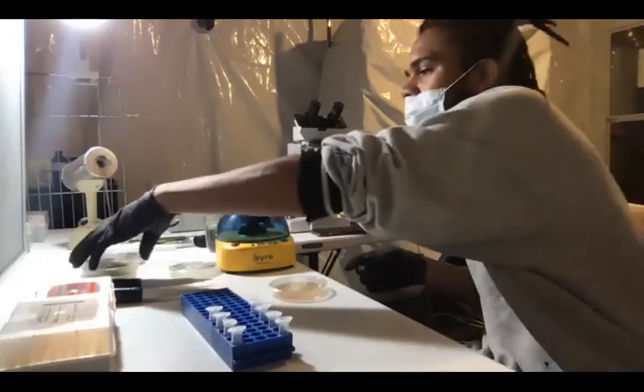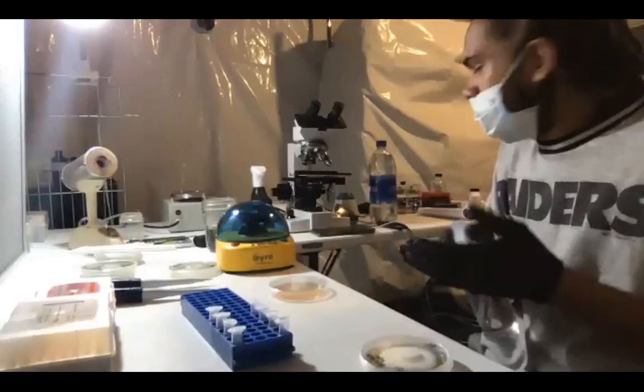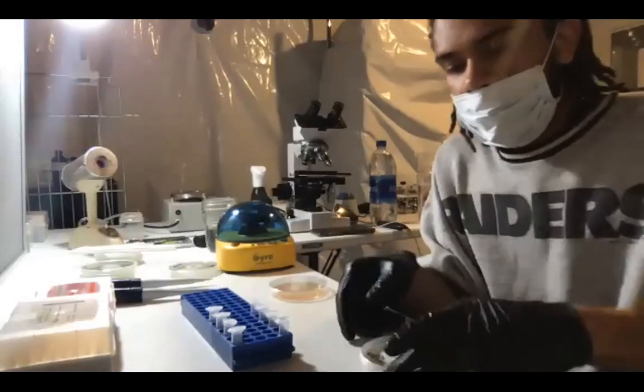So I'll set this one to the side. I'll take the next one. I'll spray the outside with isopropyl alcohol. And then repeat the steps.